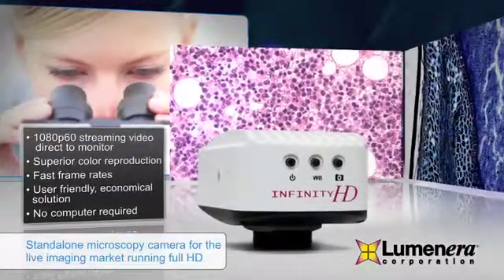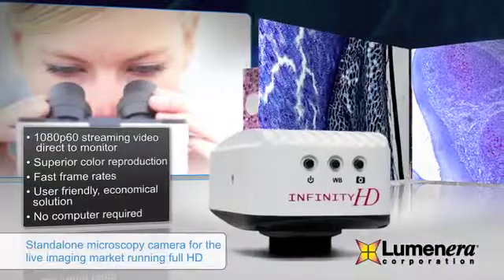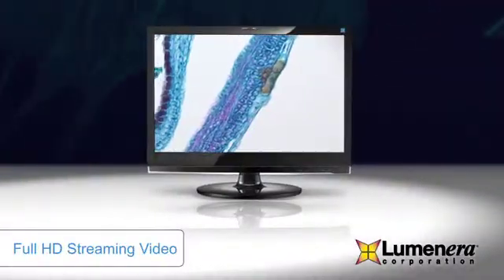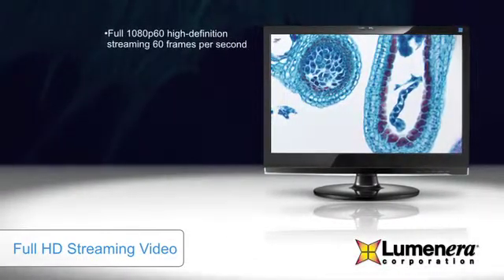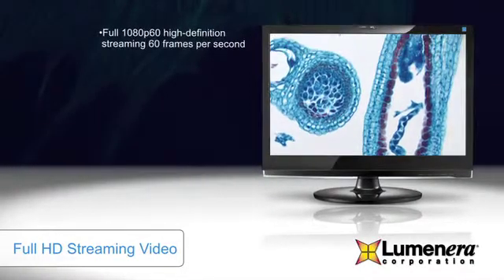With its extremely fast response times, it quickly reacts to lighting changes in any life science, clinical, or material application. The Infinity HD camera provides the required 60 frames per second needed for true high-definition, unlike many competitors professing to be HD but offering considerably lower frame rates.